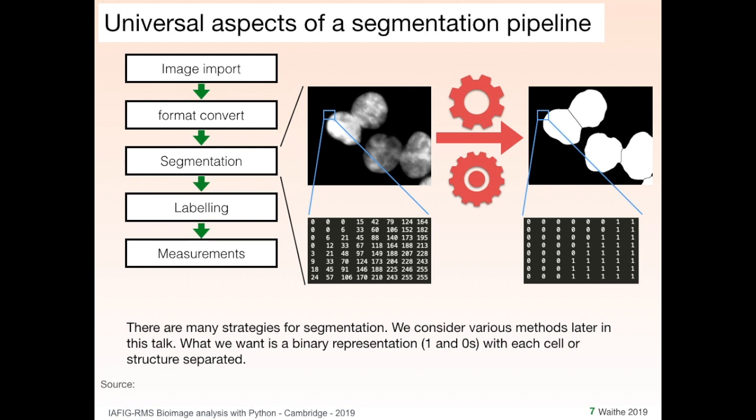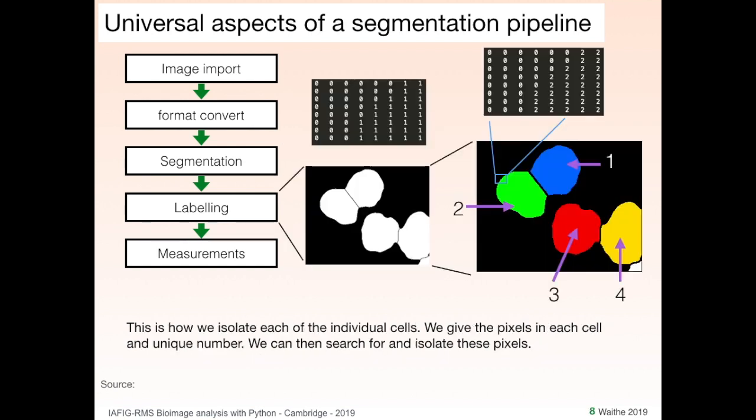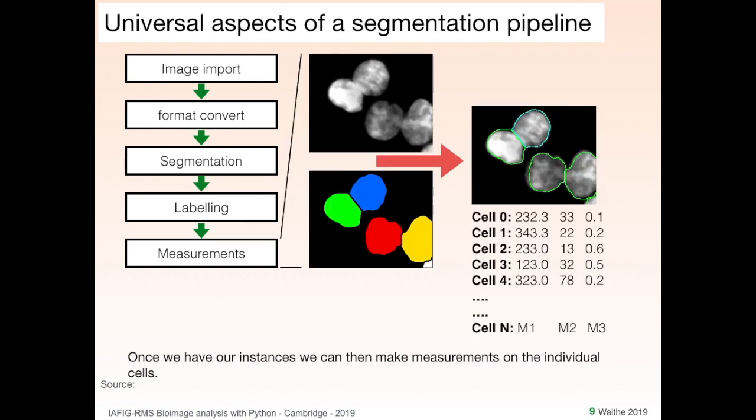But once you've done some segmentation, then it's often necessary to do some kind of labeling where we split our semantic segmentation into these regions, and we're able to isolate these and index them so that we can refer to them in our subsequent analysis, which in this case is almost invariably taking measurements from our image. So it's generally typical to go back to your raw data and to use your thresholded segmented image as a means of isolating regions and taking measurements from there.